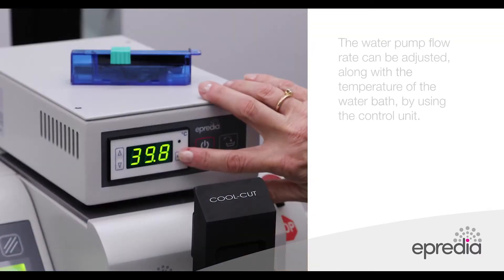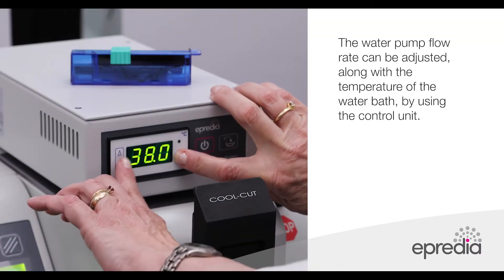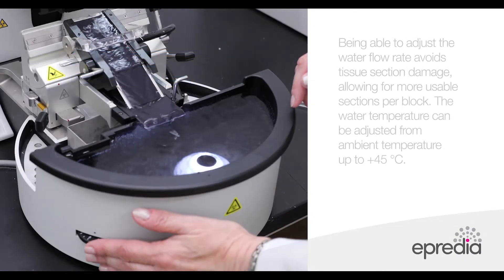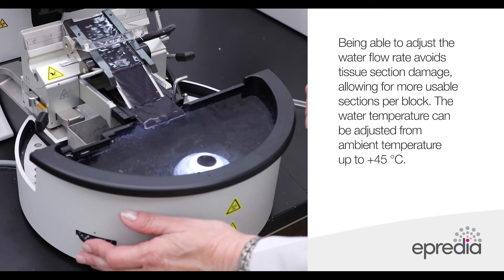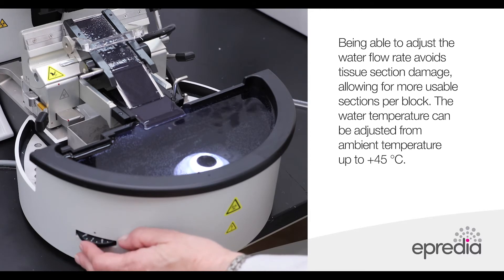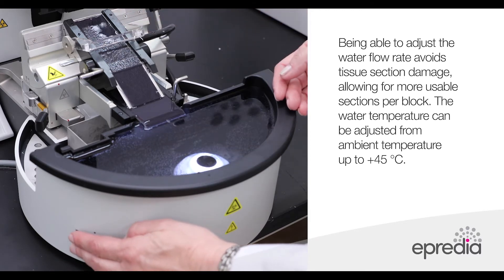The water pump flow rate can be adjusted along with the temperature of the water bath by using the control unit. Being able to adjust the water flow rate avoids tissue section damage, allowing for more usable sections per block. The water temperature can be adjusted from ambient temperature up to 45 degrees Celsius.